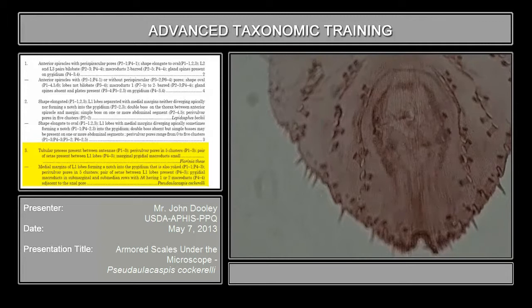There are about three species like this. I've seen quite a few come in where they don't have any ducts, and they may be undescribed species. I've also seen some with up to four or five ducts in the same area — that's a different species, normally from Korea, Taiwan, or that area of Asia. But if they only have two, most likely it's going to be this particular species, Cochorelli — the Cochorell scale. Those arrangements are very, very important. Other ones will have these large ducts all over the pygidium, but they won't be in any type of series or rows — they'll be randomly distributed. So sometimes you'll need to count them to find out what species you have. This is probably one of the more common ones — Pseudalocaspis coccorelli — occurring worldwide, almost every state.